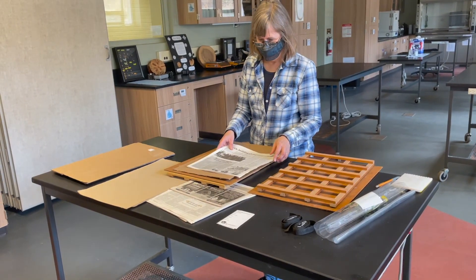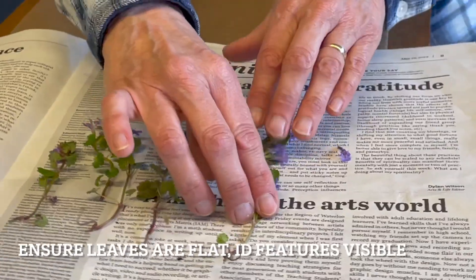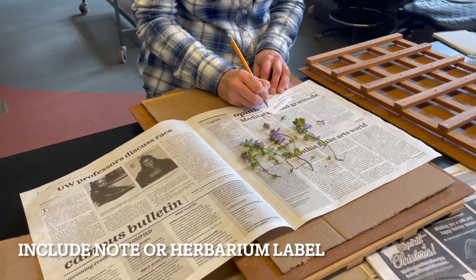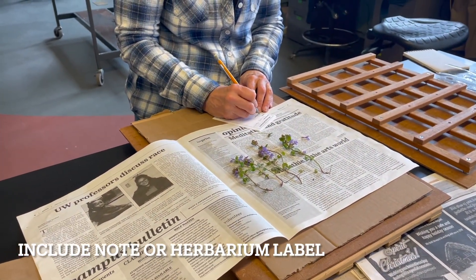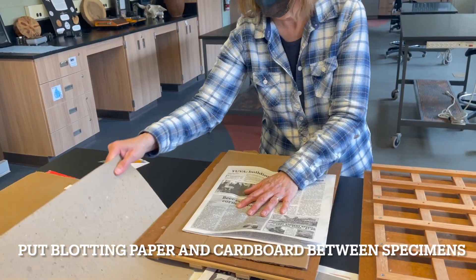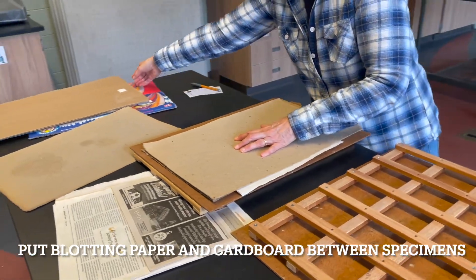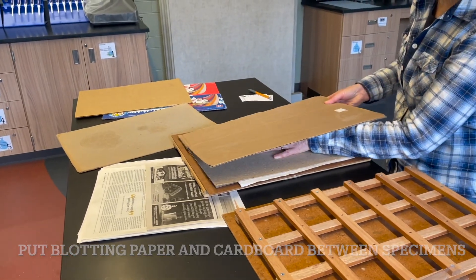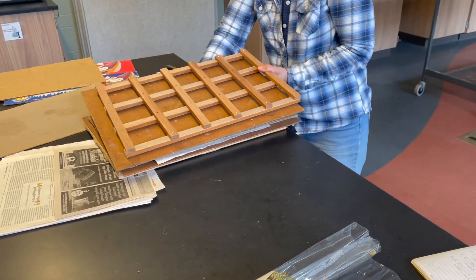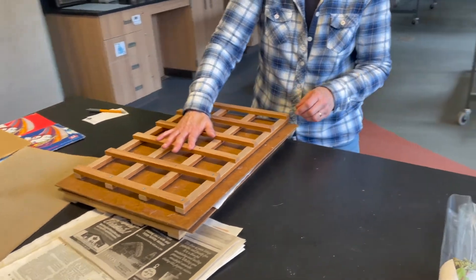Place the specimen between layers of newspaper with leaves flat and flowers spread and important ID features apparent. Include a label with necessary information. You can even make the final label at this point if documenting for a herbarium. Place blotting paper and cardboard between specimens. Blotting paper is used to absorb some of the moisture. Extra newspaper can be used if blotting paper is not available. While you prepare your next specimen, it is helpful to place the press frame on top of the pressed specimens to keep the plants flat.